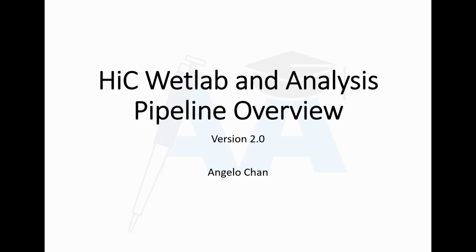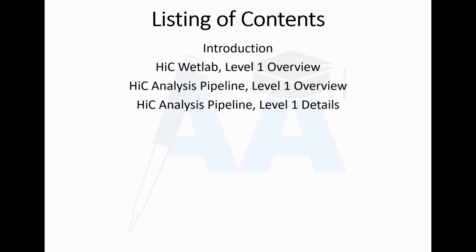Let us begin. I'll start by giving some background information on the topic before explaining what HiC is and the molecular biology behind it. Afterwards, I'll explain the bioinformatics pipeline for processing HiC data, first with an overview, and then elaborating on that at a higher level of detail.